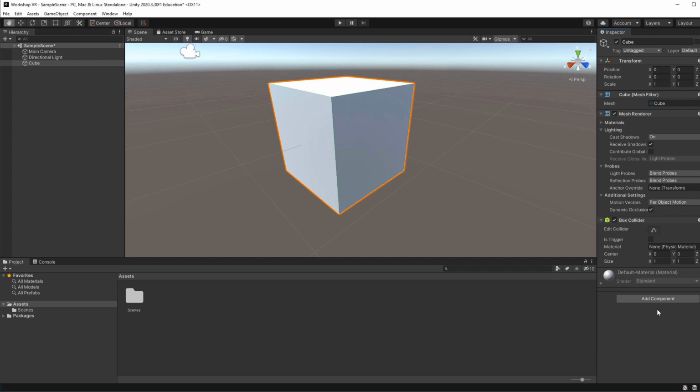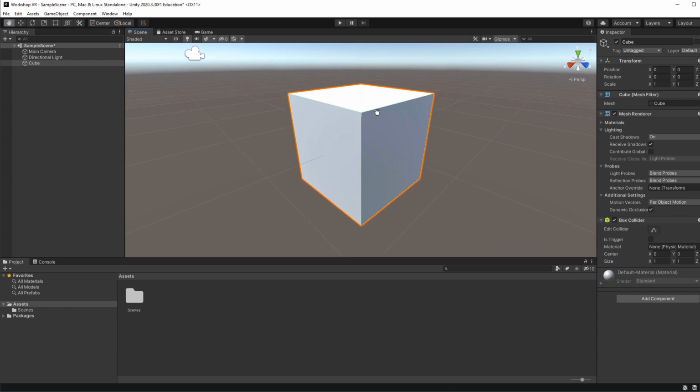So with that being said, you can create components that are based on some script that performs, let's say, compute operations and different programmatic things by using the script and programming.